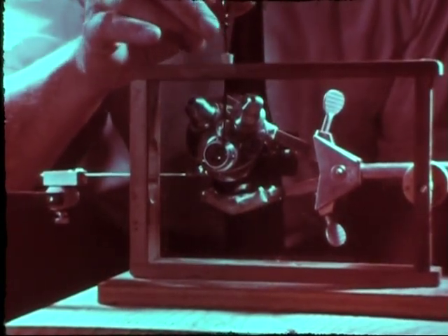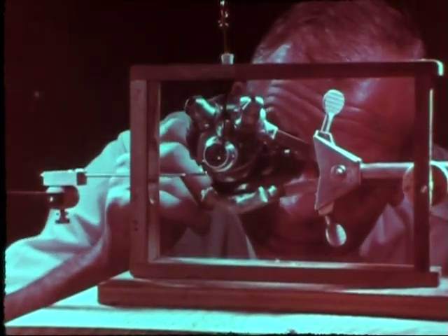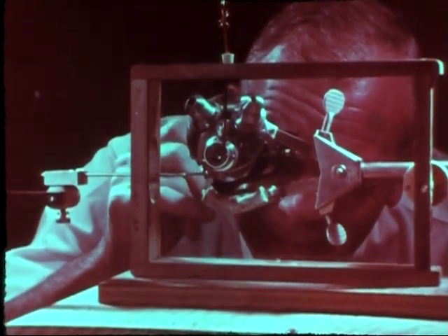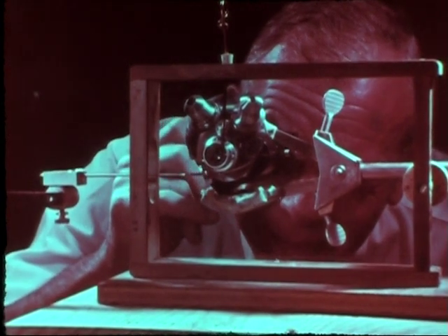These historic microchemical techniques determined the weight of the plutonium sample to be exactly 2.77 micrograms.